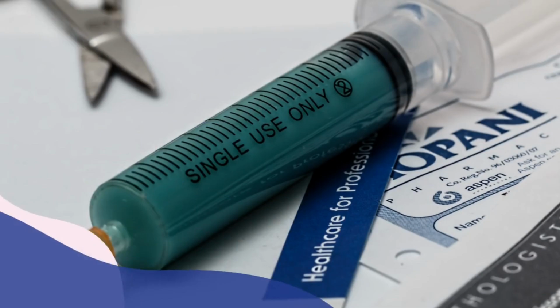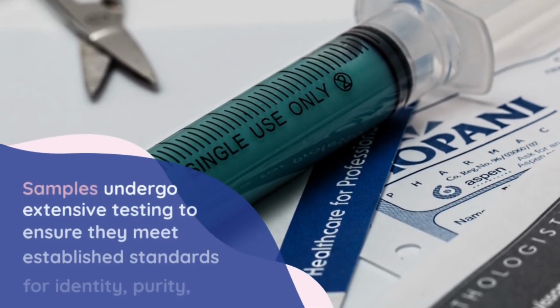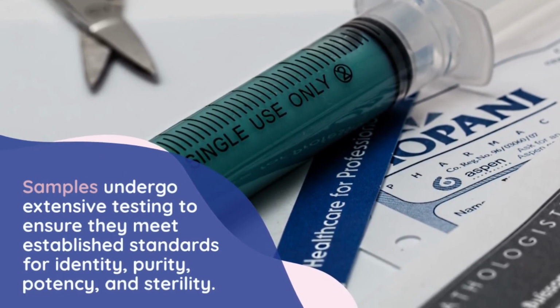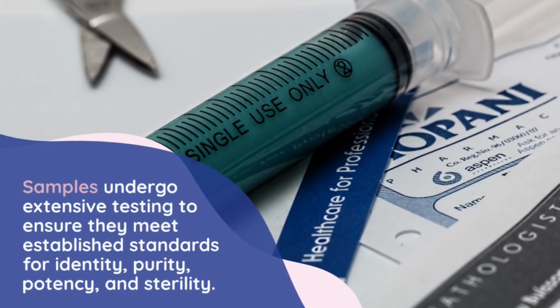9. Quality control testing. Samples from each batch of manufactured injectables undergo extensive quality control testing to ensure they meet established standards for identity, purity, potency, sterility, and other critical parameters. This includes physical, chemical, and microbiological tests.